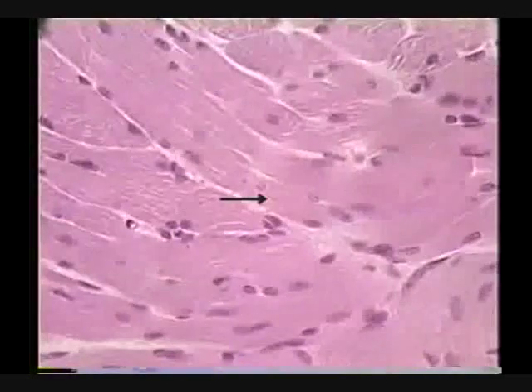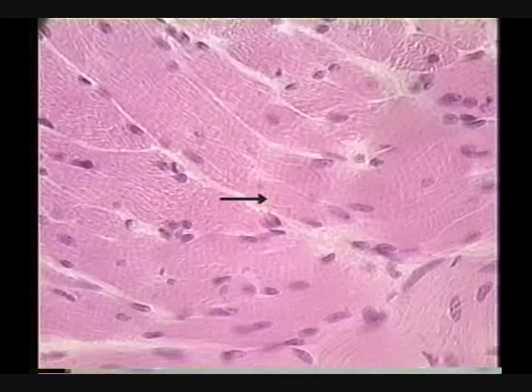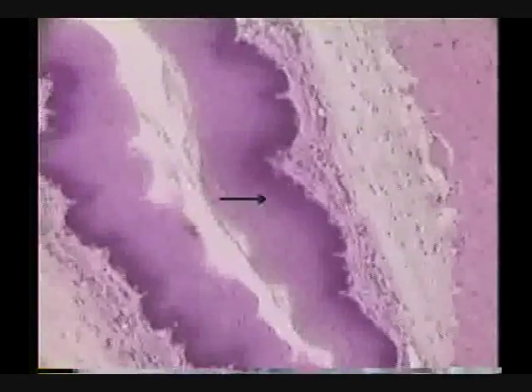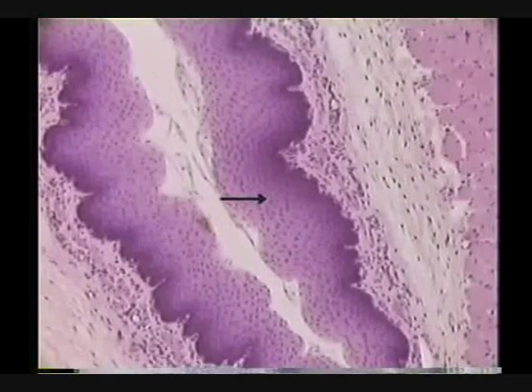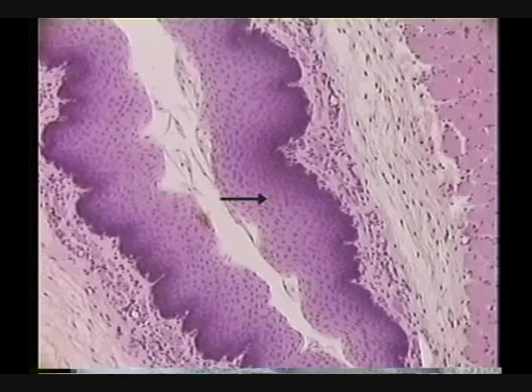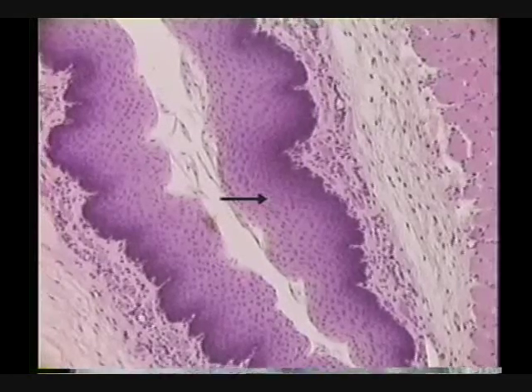That's good because you can't even see the details on here—well, you can see the details, right? You guys are doing good. Identify the tissue indicated by the pointer. The tissue is non-keratinized stratified squamous epithelial tissue.